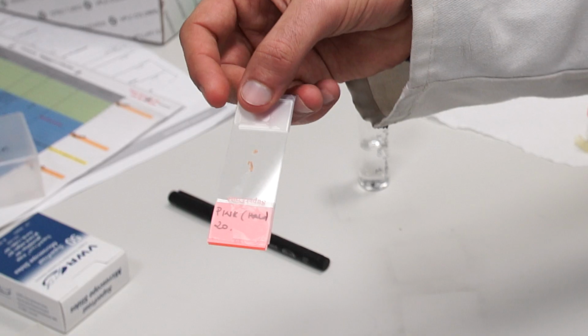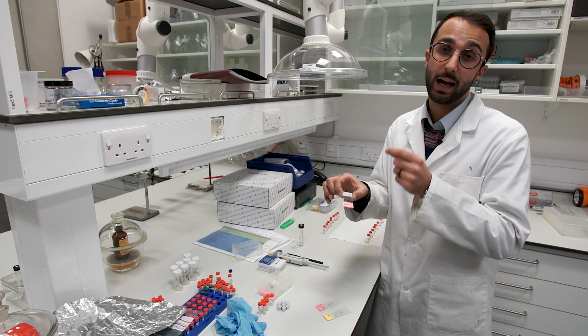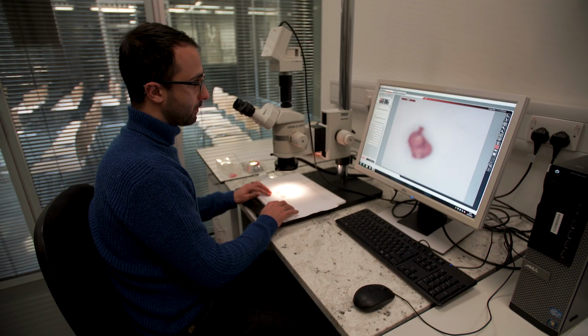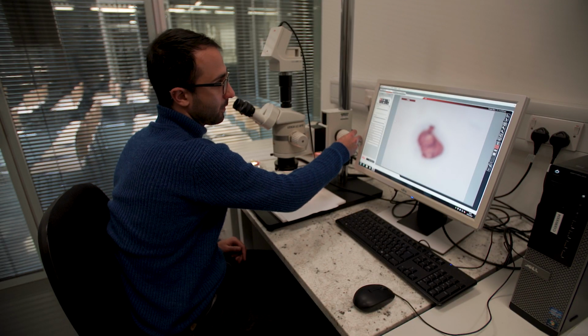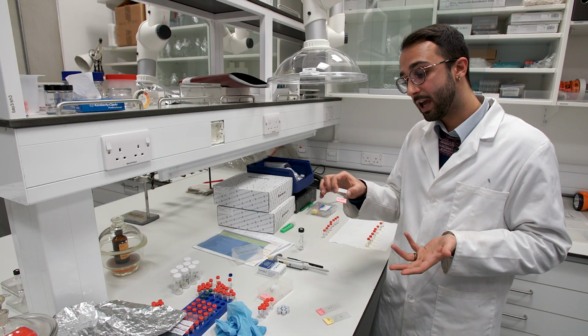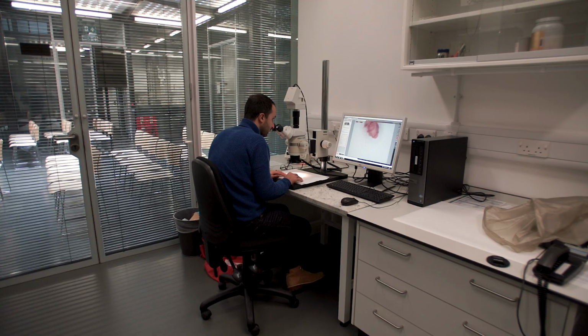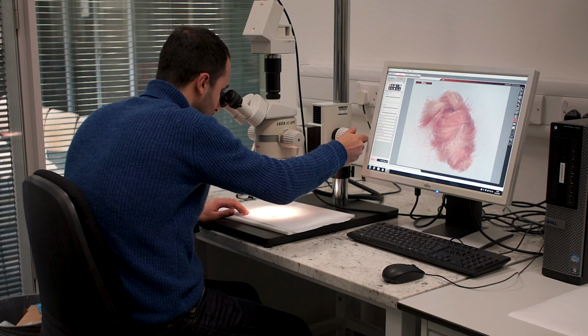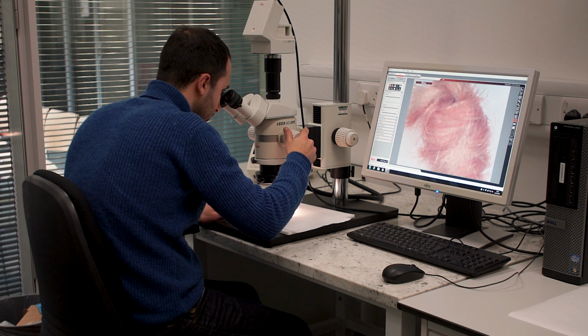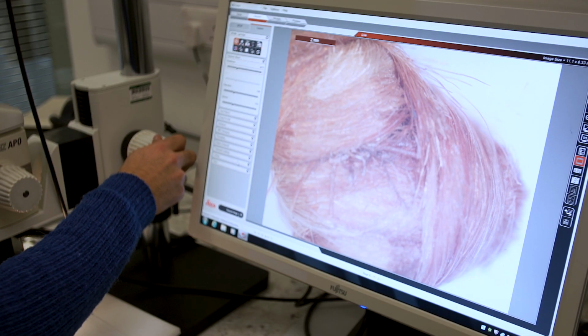We did this because we wanted to be able to look at the fibers under the microscope with high magnification in order to understand if the threads were dyed one by one or if they were dyed all together, if mixtures of colorant were used. So the microscopic observation already gives important information about the dyeing technology.